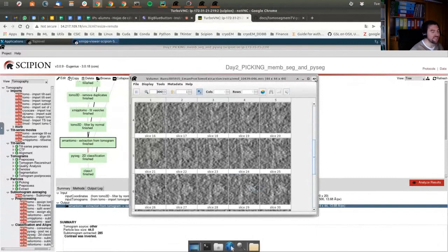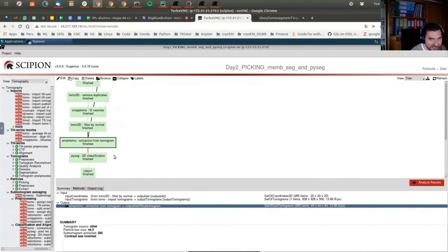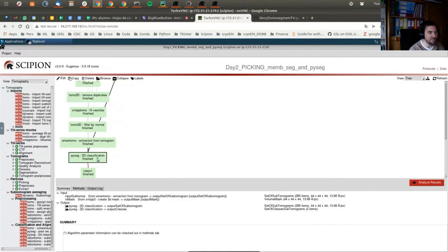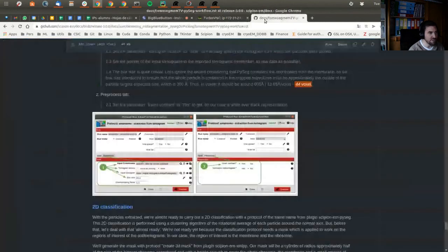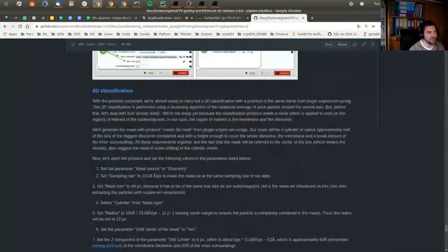Finally, it's been quite hard to reach this point, but we have survived. So, Pyseg classification. As explained before by Antonio, it offers different options, which will be briefly discussed here.